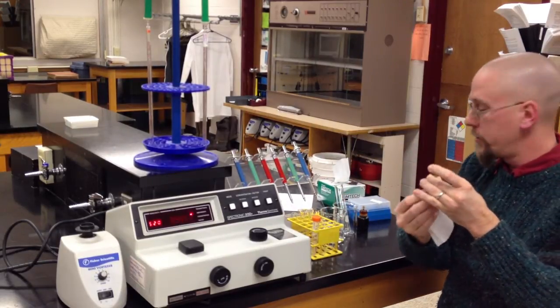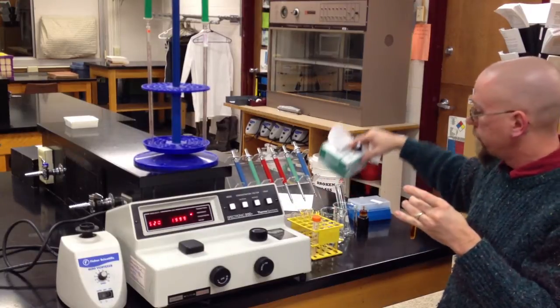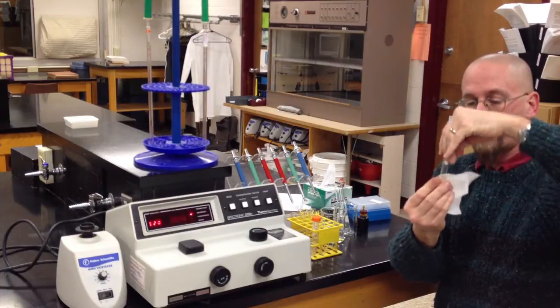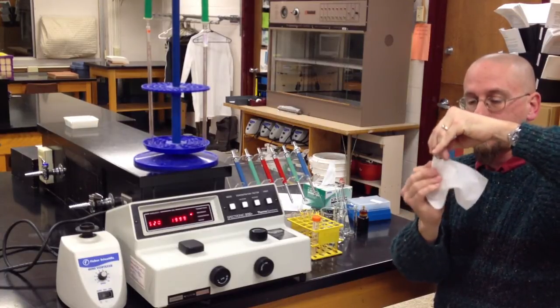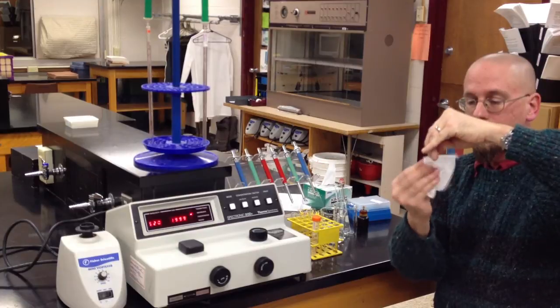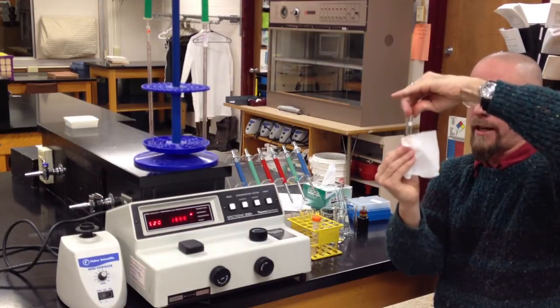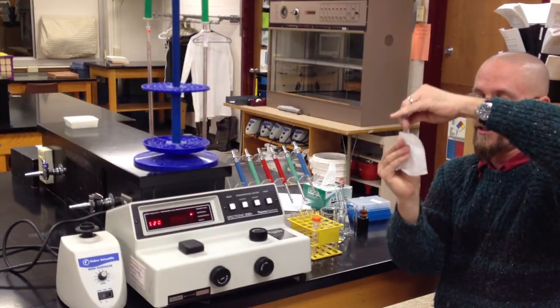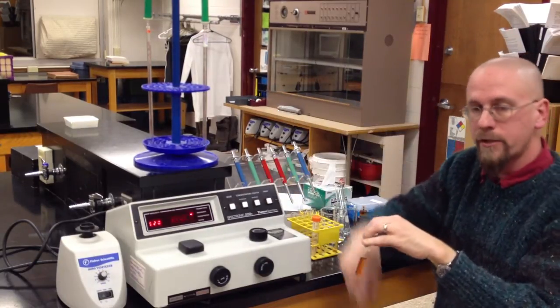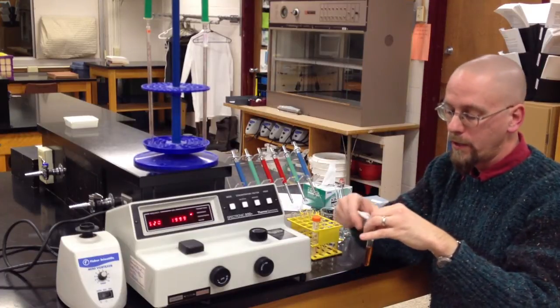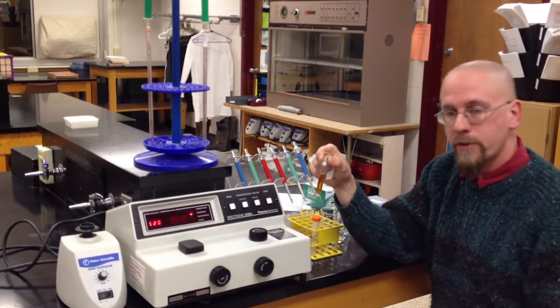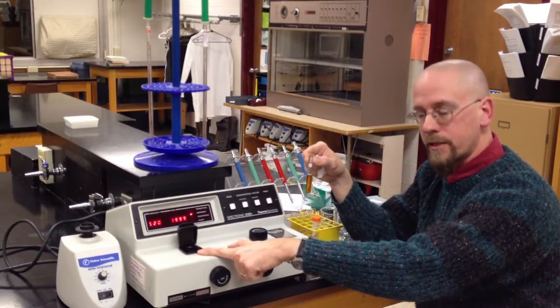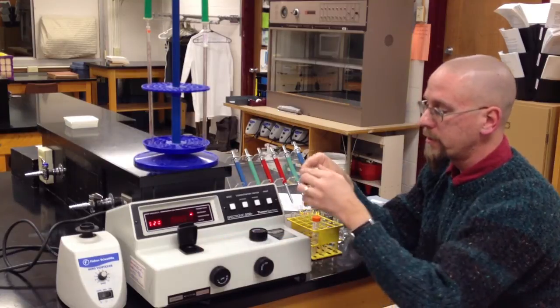Once you've done this, what you want to do is grab a kim wipe and clean the glass. You want to make sure that you do not grab these cuvettes with your fingers below the white dot because the oils and greases on your fingers get on the glass and interfere with the light going through the instrument. There's also a white line on the front of the cuvette that lines up with a score mark on the sample chamber.